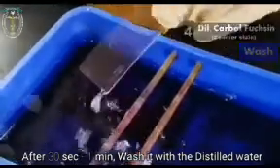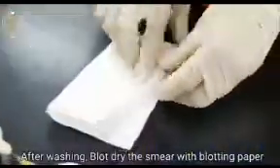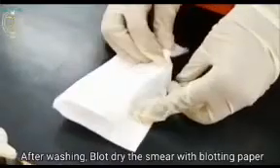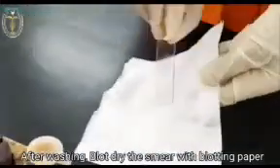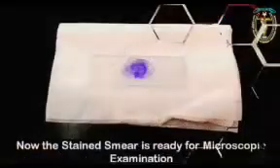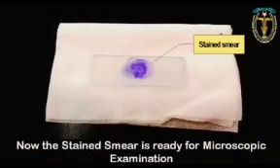Then you blot dry with the blotting paper, and place the stained slide under the microscope stage for examination.